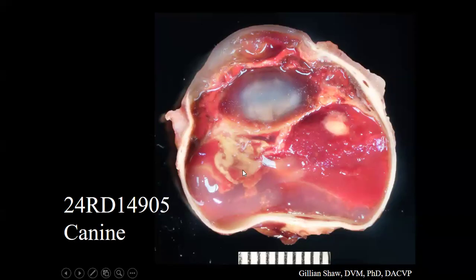And then there's material in the subretinal space, including probably some gelatinous stuff, kind of similar to what Dr. Brown just presented, some hemorrhage, et cetera. And then the lens itself is a little bit cloudy, so there's a cataract. So those were the main gross findings.